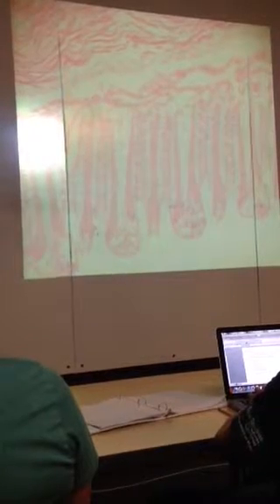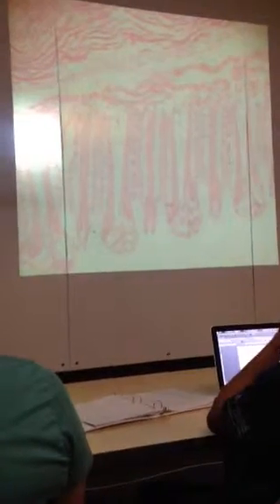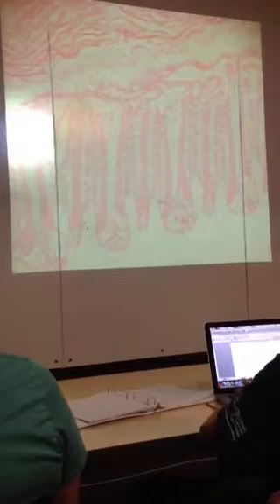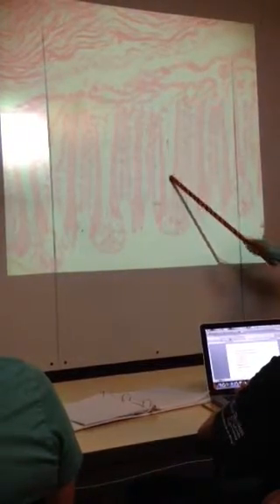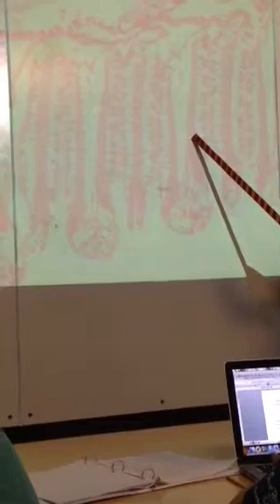What are these? Tongue bars, right? And then the spaces between them. So these are actually little U-shaped things that are tongue bars. What are the spaces? Those are the internal gill slits.